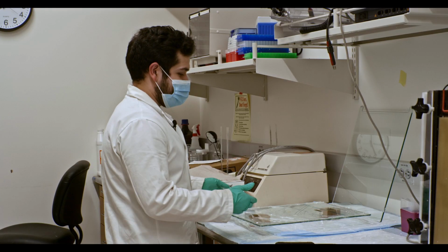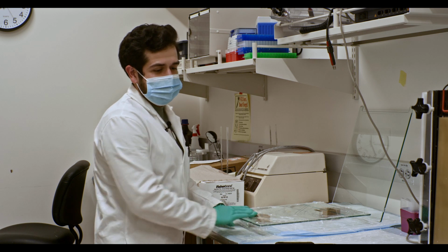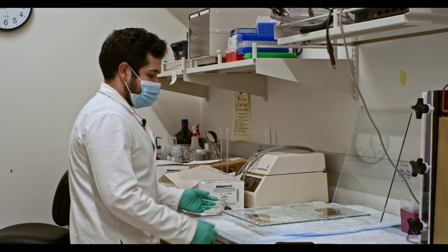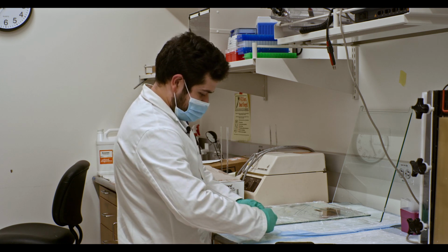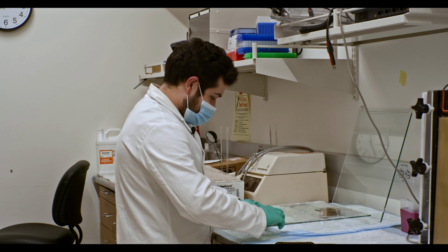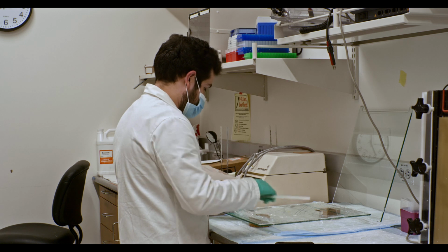Now we get to deconstruct and throw away the gel. Since the gel is radioactive material, the gel must go into a solid waste bin. The best way that I do this, I use the actual saran wrap in order to pick up the gel. An easier way to do this, if you manage to do it this way, is to siliconize both glass plates. This will make your life a little bit easier.